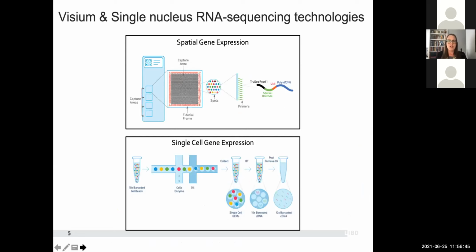To further our understanding of gene expression within the context of the spatial organization of the human cortex, we used the recently released 10x Genomics Visium platform to generate spatial maps of gene expression in the 6-layered dorsolateral prefrontal cortex of the adult human brain. For those of you who aren't familiar, Visium uses a patterned array of spots with barcoded oligo-dT primers to capture the mRNA from a tissue section.